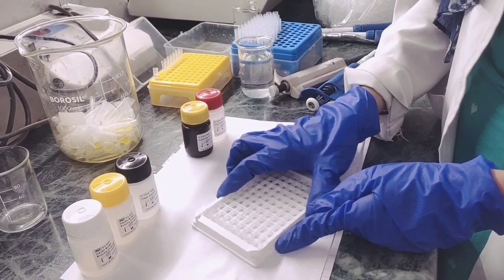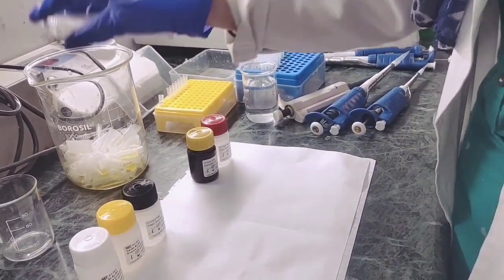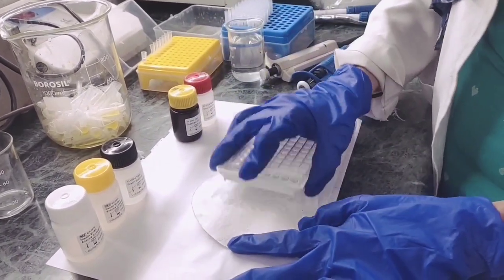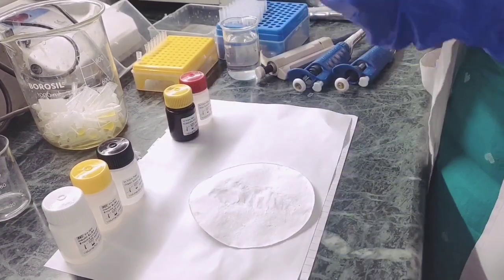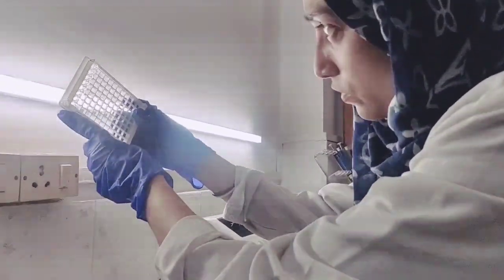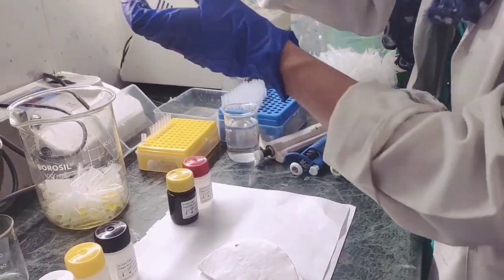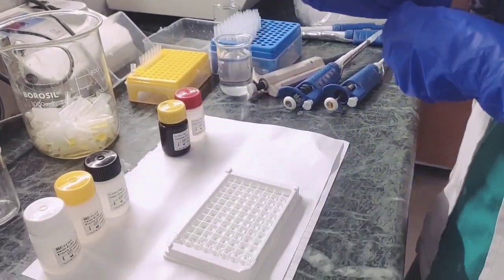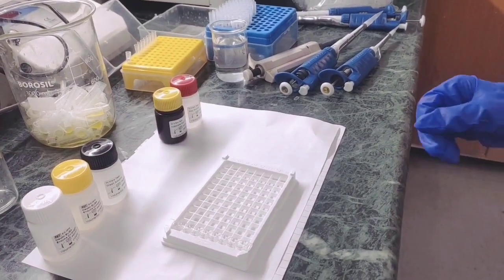Again, we'll shake slowly and discard all the contents, and then we'll again tap the microtiter plate against the absorbing paper. Then we'll make sure there are no droplets of wash buffer left in the microtiter plate. So our plate is completely dried. Now we will add 50 microliters of substrate solution.